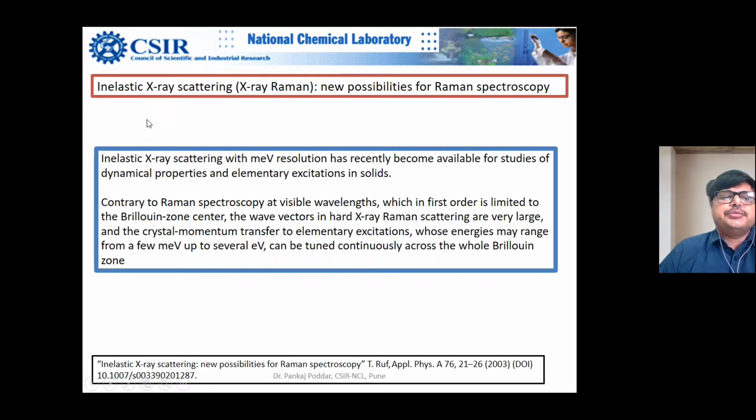And as I mentioned, you can do inelastic X-ray scattering, which is actually a new dimension of Raman spectroscopy. X-ray Raman is a new way of doing that, with tunable X-ray energy, if you can tune the energy of the X-ray by taking different X-ray lines.